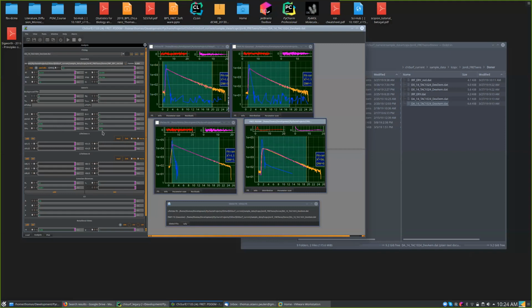Acceptor is excited, what? No, the donor. Okay, like this 2% is correct in principle? No. Yes. No, we don't look at the excitation of the donor by the red, but we don't have the red laser pulse here. We have only the blue laser pulse.